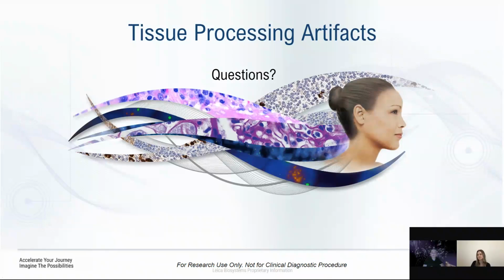Absolutely. We like to see specimens fixed for 24 hours. Usually most facilities have that variation below that. I've seen 6, 10, 12, but we try to reach that 24-hour mark. And once you go over that, what you're doing is building those cross links that help preserve the tissue.